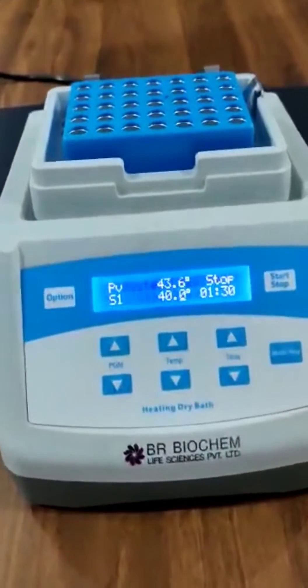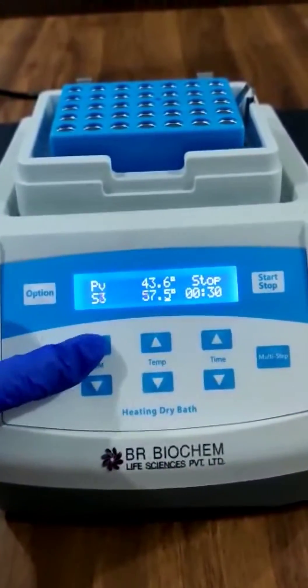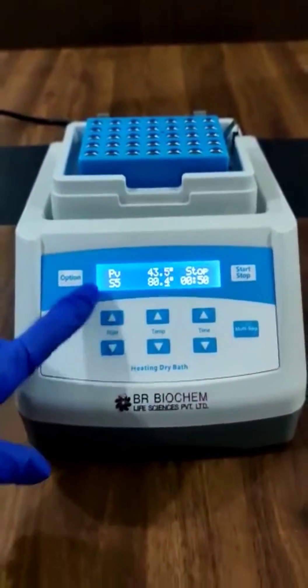By pressing the switch behind the machine, you can start the dry bath incubator. From these two keys you can set the program. You can save five programs in this dry bath incubator.